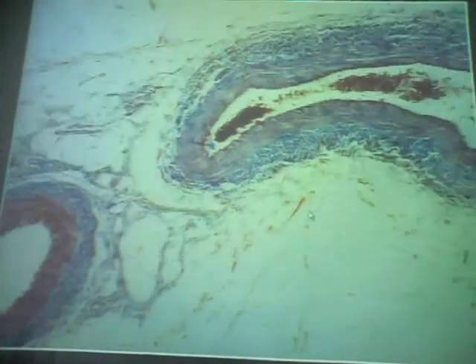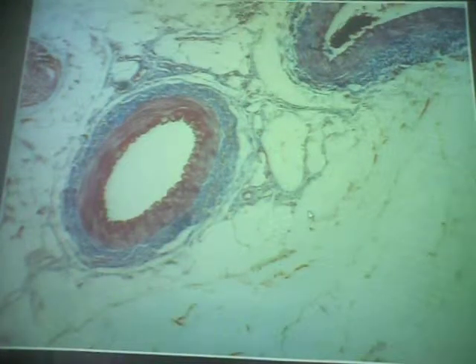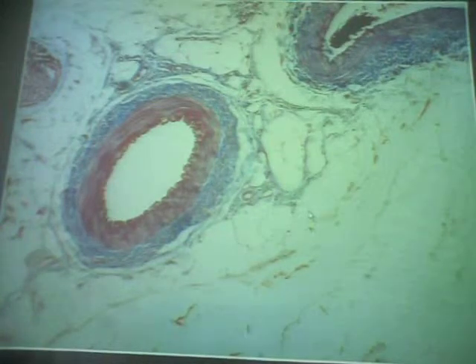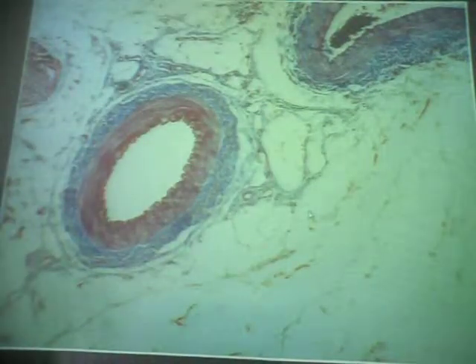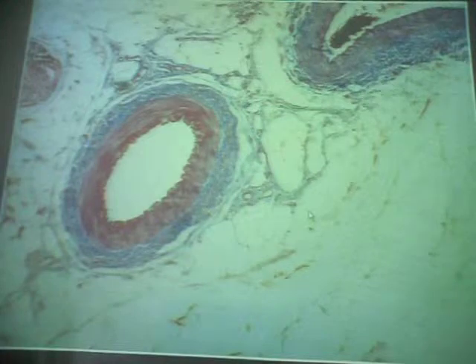And as I said, from now on, I'm going to expect you to identify blood vessels in tissue sections. This is very important when you get into the next units. You look at the digestive system because you're going to have a lot of ducts. Okay? D-U-C-T-S, not D-U-C-K-S. All right? These are tubes, and you've got to be able to differentiate between blood vessels and the ducts on these various glands. You're going to see them in salivary glands, you're going to see them in the liver, you're going to see them in the pancreas. So you've got to be able to pick them out.